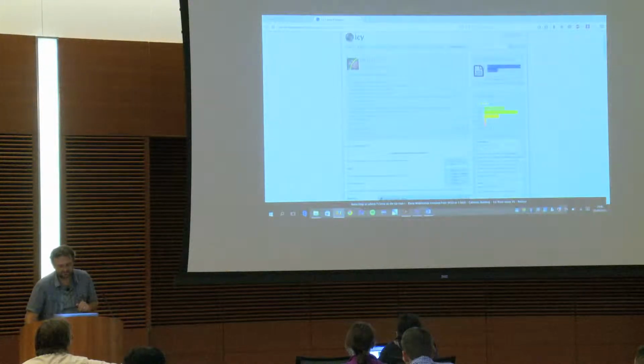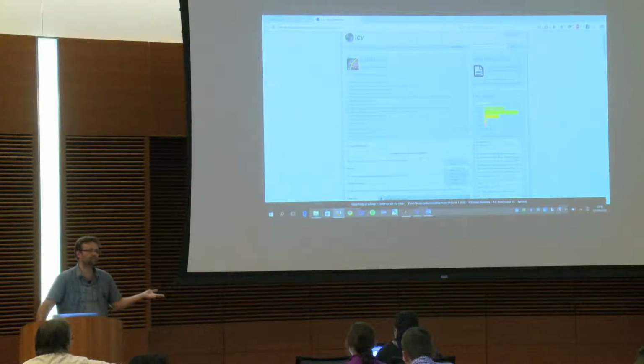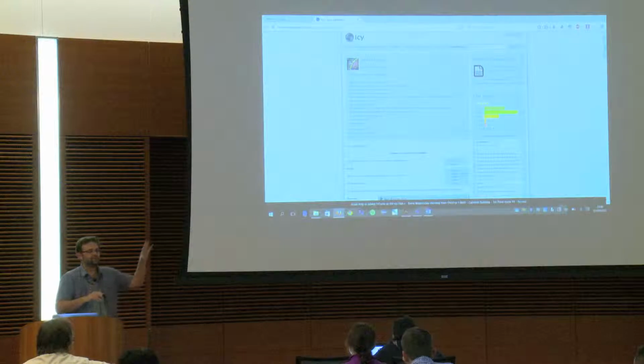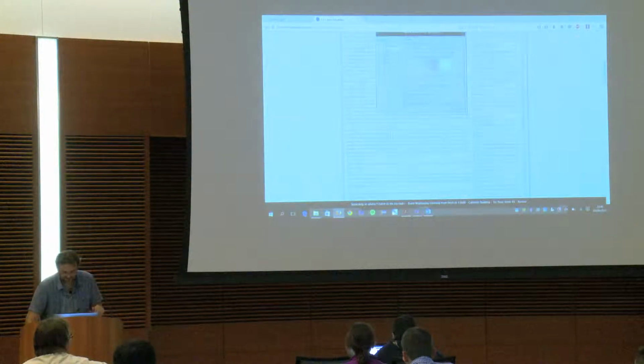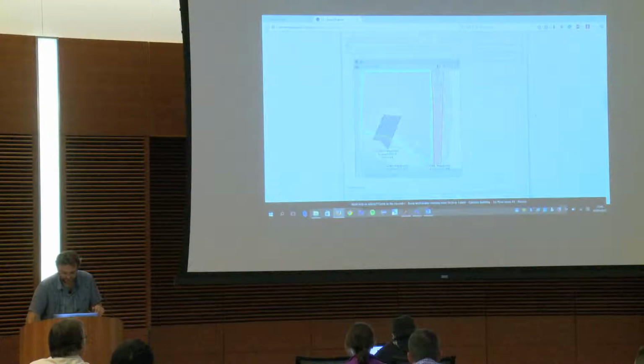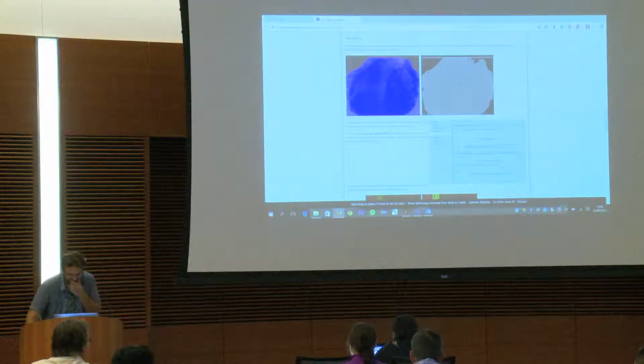But this is serious. I mean, this is something that we keep changing. Now we would like to monitor if you are using, let's say, 10 times the same plugin within Icy. We don't need to have the numbers. Icy will pop up something saying, okay, remember that you are using this plugin. This plugin, it is this publication. Don't cite us, cite the publication. So it's you first. And here you have all the documentation, here all the ratings. And by the way, everything that we're doing together in this tutorial is here.